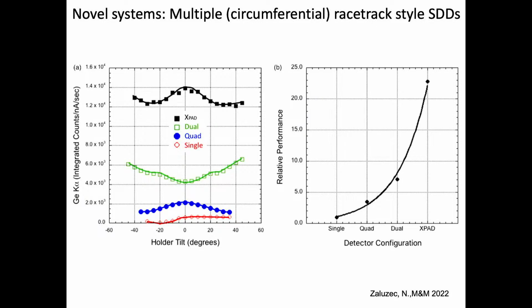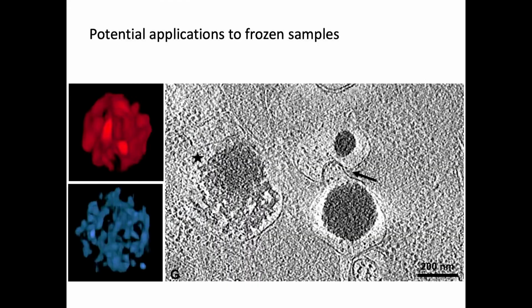And if we consider that a lot of the drugs that we use to treat these parasites, or for other purposes now, there's tons of work where they combine different elements with different drugs, so we could even map these drugs inside cells. So this is something that is really exciting in the field.